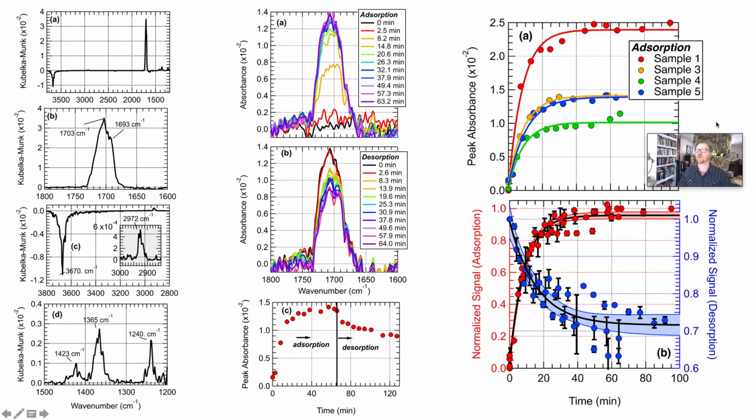So now what I did over here, so these are like different samples. We made 5 different samples, sample 1, 2, 3, 4, and 5. Sample 2, as it turned out, nothing happened, and we're still trying to figure out why. But if you notice this, the absorption profile takes on a first order Langmuir adsorption equilibrium profile. So that means it's going to be a first order evolution, and then it's going to hit equilibrium and then stop, right? And that's great. So you can see we proved that it hits equilibrium, which is really cool.